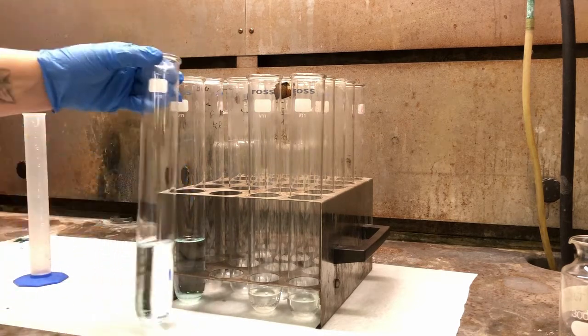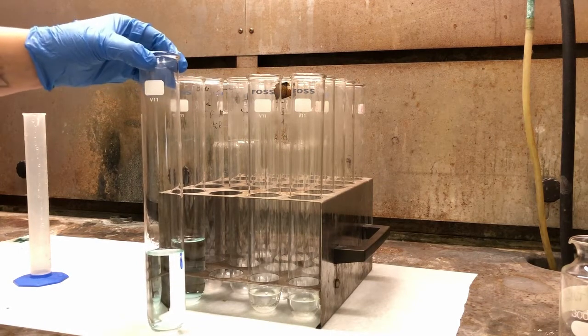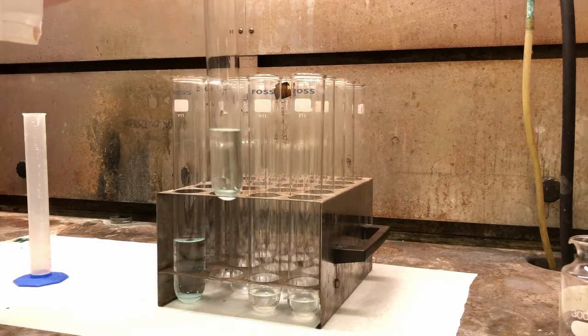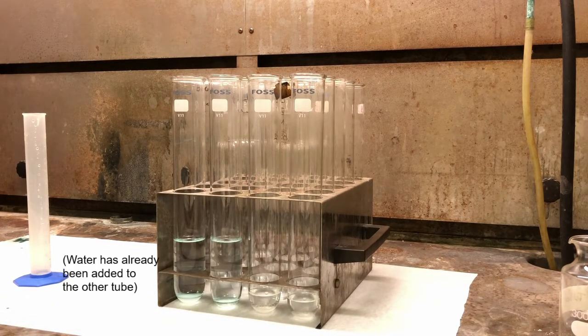And now you can really see that bluish green color. So that's the color we would expect to see. So now that those are all done, we're going to go ahead and start our distillation.